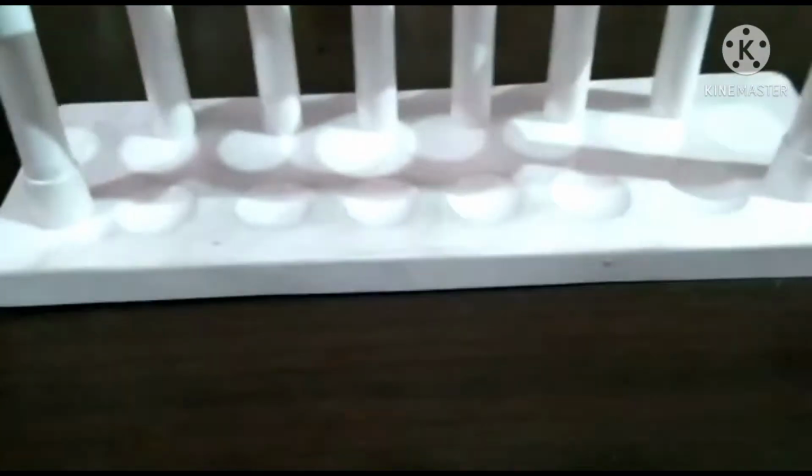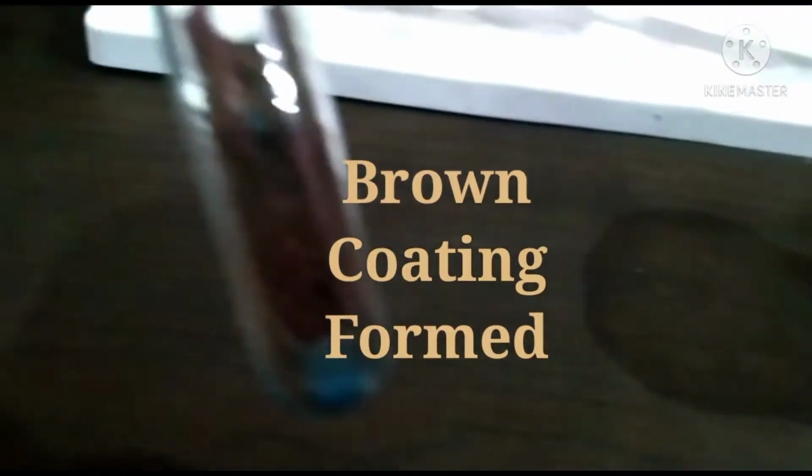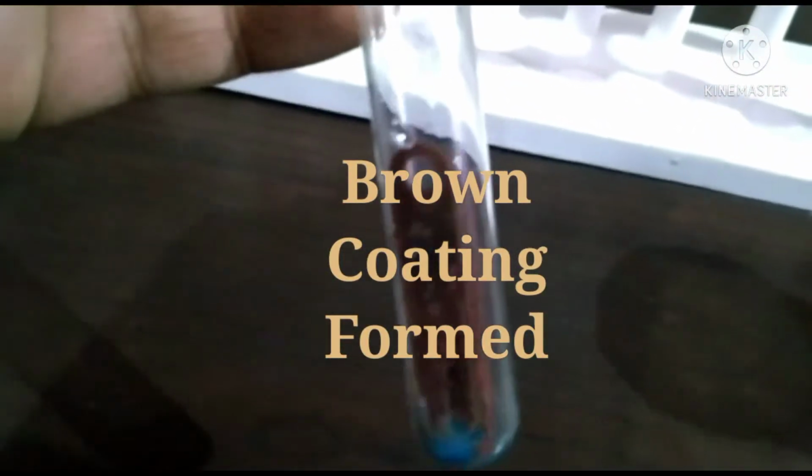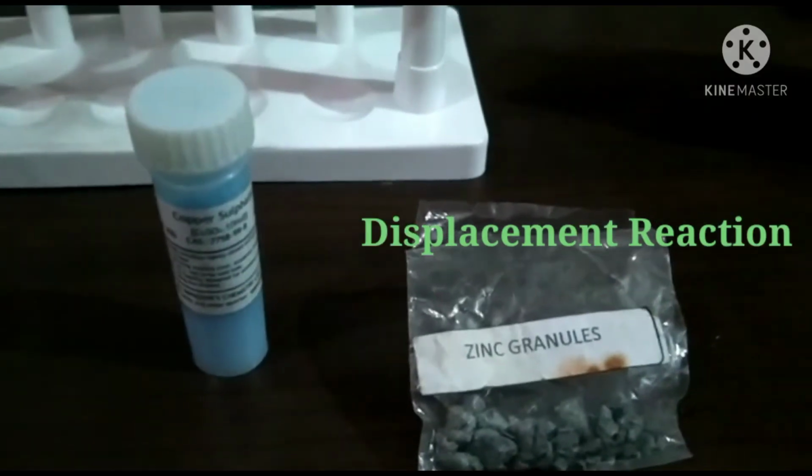If I show you, you will observe that the solution is slightly changing its color, but the main difference is that the iron, which was silver, has become brownish due to the deposition of copper. This is the displacement reaction. The color of the solution has changed and the silver color iron has become brownish due to the deposition of copper.